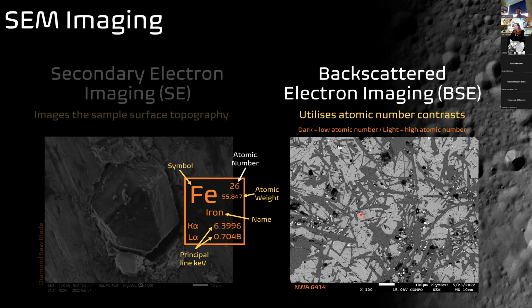Because of course we're doing geoscience and we then take these into doing chemical analysis, we're typically working on polished flat samples. So backscatter for us is really important because we polish our samples flat. There is no surface topography. So secondary electron isn't hugely useful for us.